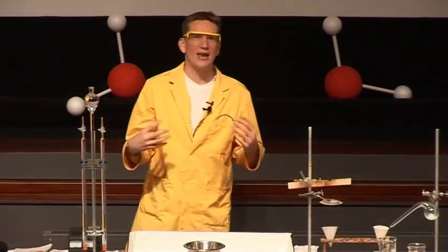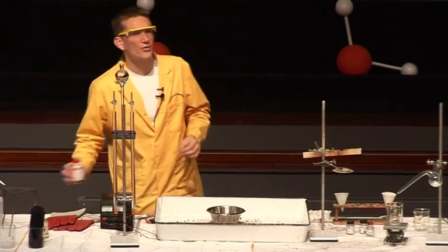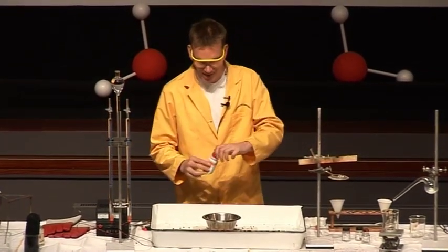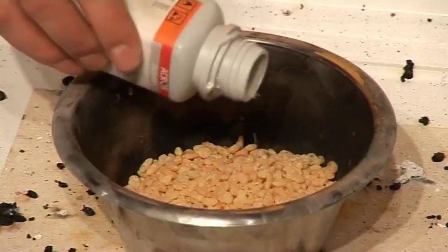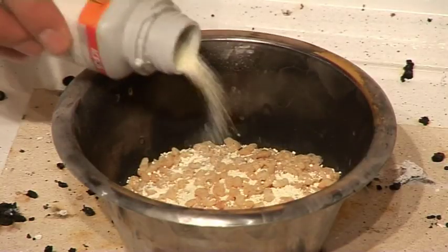So the Rice Krispies are flammable — we can burn them; after all, this is what gives us our energy. But this time, rather than using oxygen, either from liquid oxygen or the oxygen from the air, I'm going to use a solid compound called sodium peroxide. So I'm just going to sprinkle this over the Rice Krispies, in much the same way you'd sprinkle your sugar on your Rice Krispies.